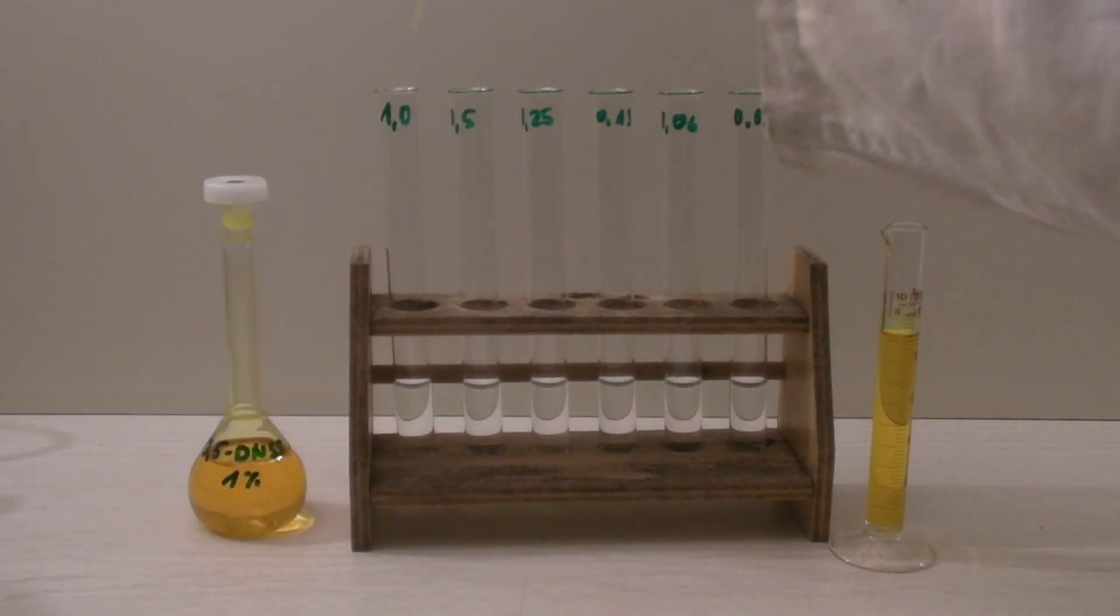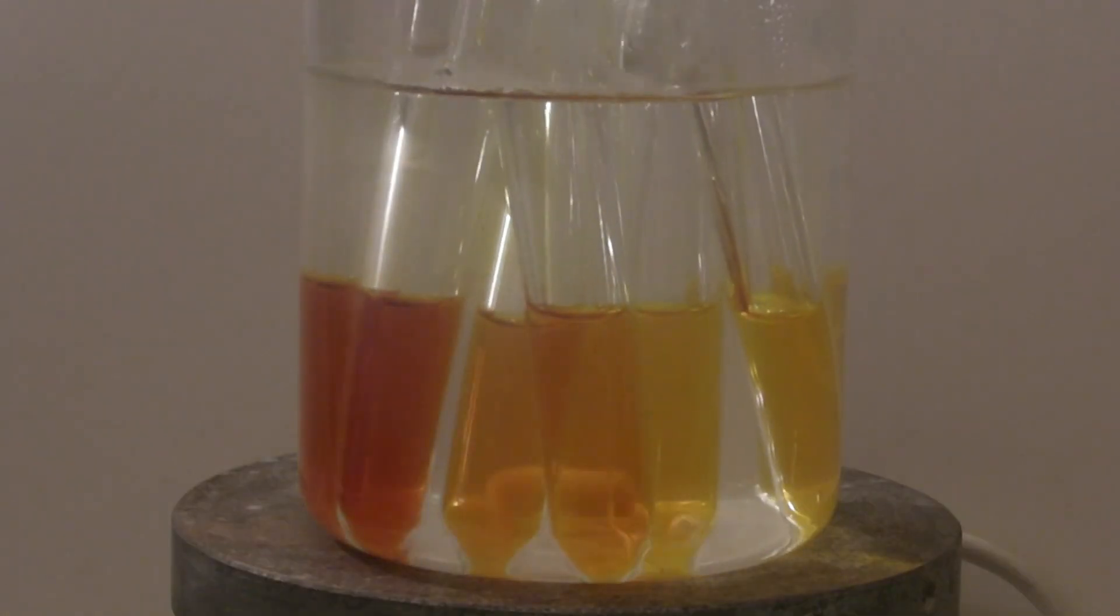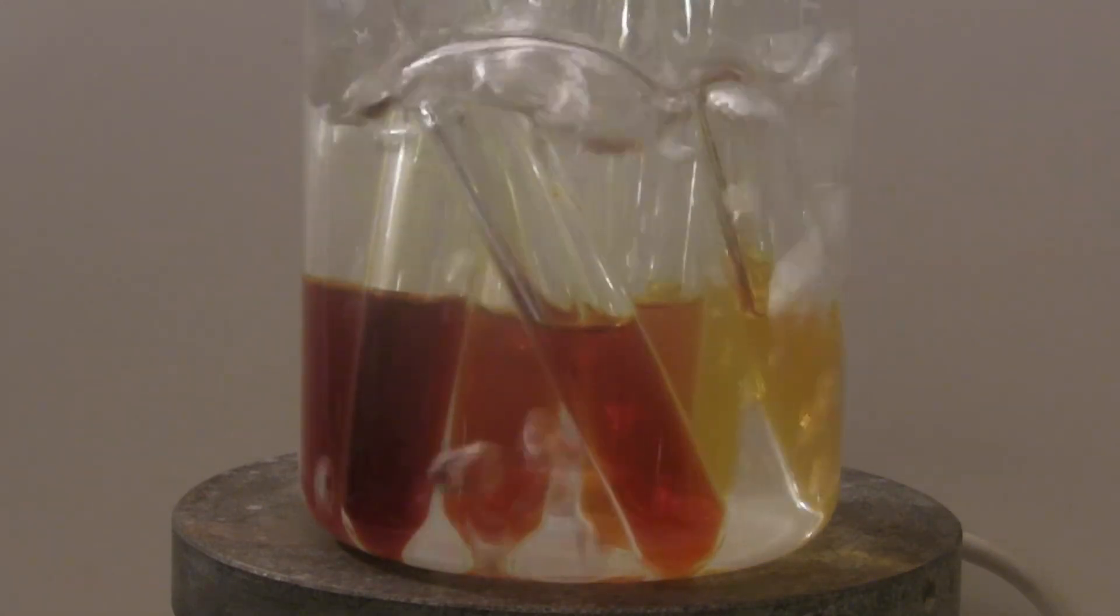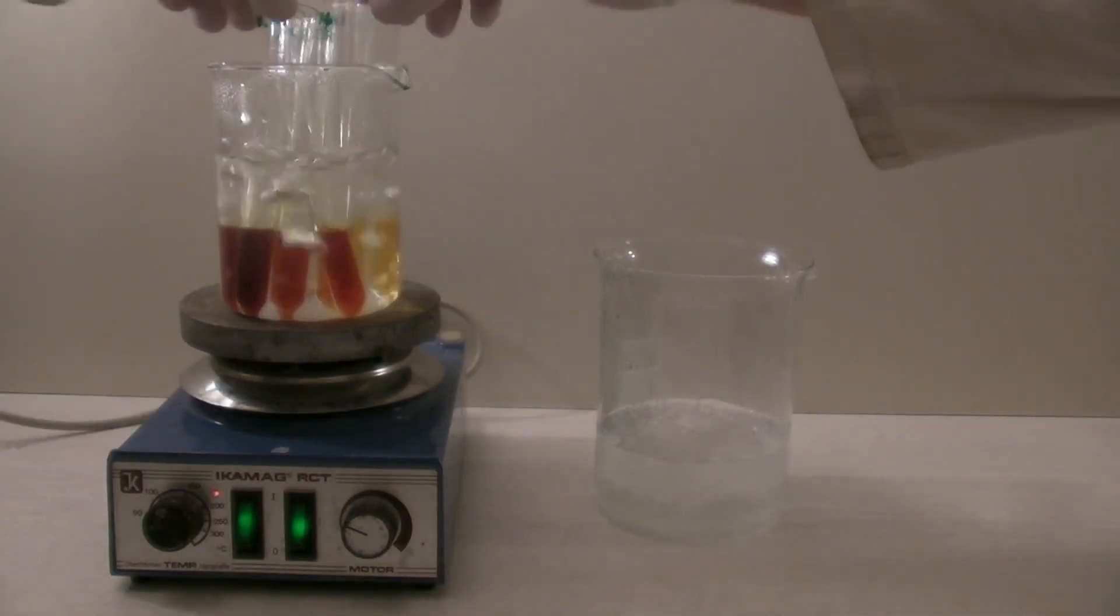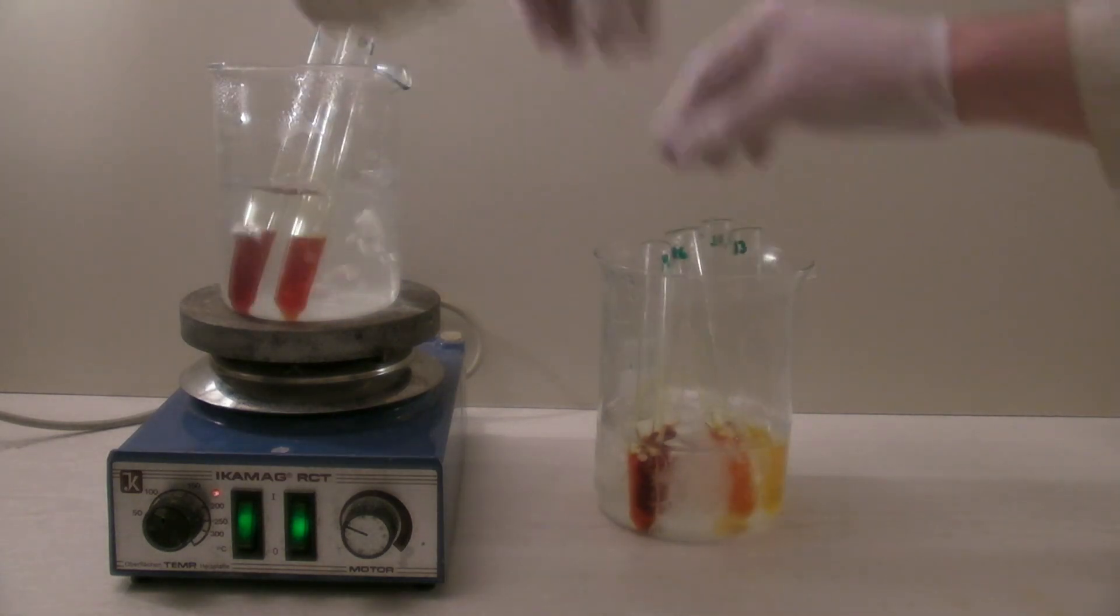Next, a dilution series with glucose was prepared, where the concentration was decreased to half of the amount in every new sample, beginning at 1%. In the quantitative detection, the samples are cooled with ice after the heating to prevent further reaction.